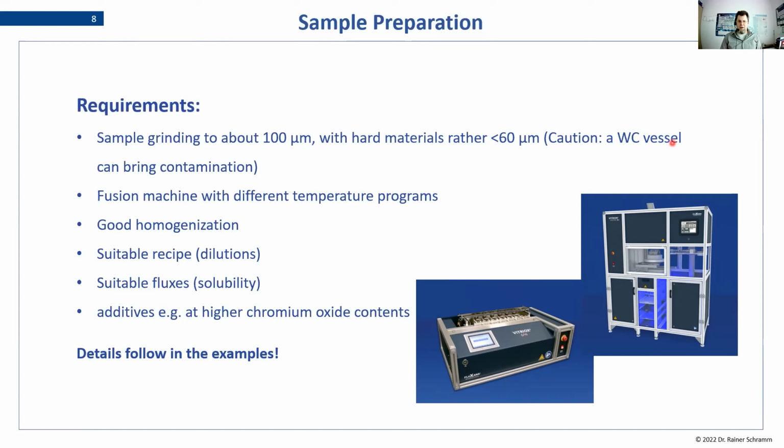And all the other ones, for example, there is another one which is zirconium oxide. It's also pretty hard in terms of crushing power, but the problem is zirconium is a very important analyte in our material. And grinding always means contamination. We always get something of the vessel inside of our powder and of our sample, and contaminating the refractory with zirconium is not helpful at all.